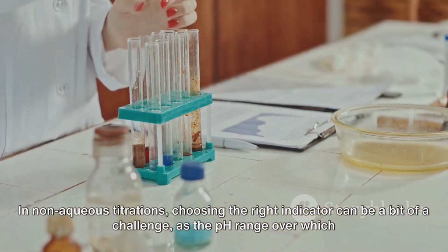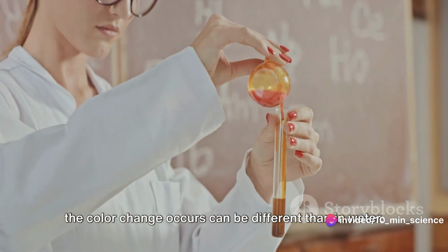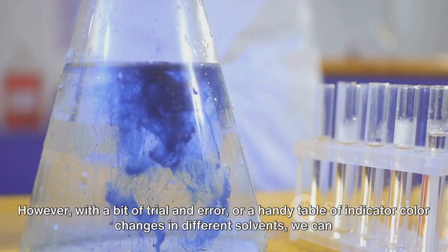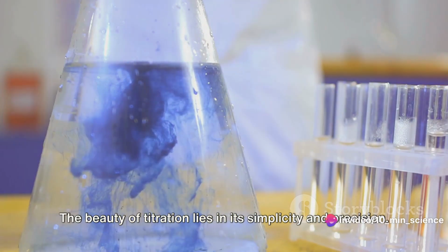In non-aqueous titrations, choosing the right indicator can be a bit of a challenge, as the pH range over which the color change occurs can be different than in water. However, with a bit of trial and error, or a handy table of indicator color changes in different solvents, we can usually find an indicator that fits the bill.